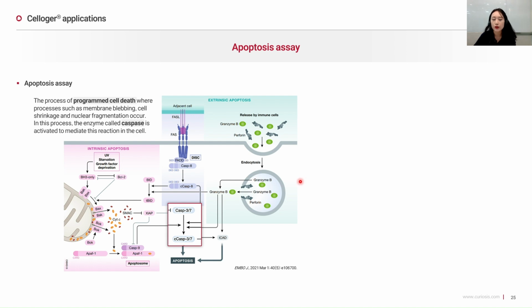Apoptosis is closely tied to cancer development. It's a big focus in the development of new anti-cancer drugs, and it's often used to assess the toxicity of potential drug candidates. Typically, when running an apoptosis assay, researchers target the annexin V marker and use endpoint methods like flow cytometry. But these methods require several steps like fixing and washing the cells and only give you a snapshot of apoptotic cells at a specific moment in time.